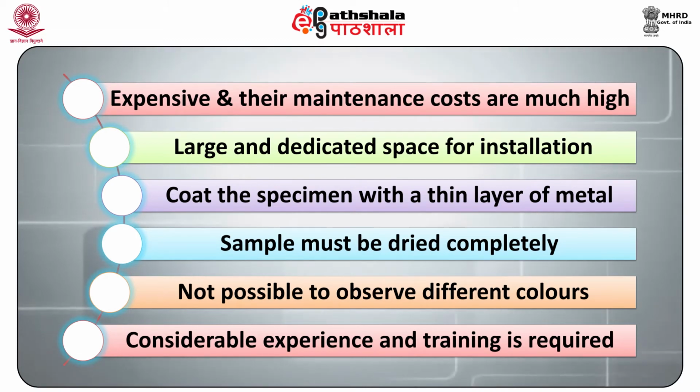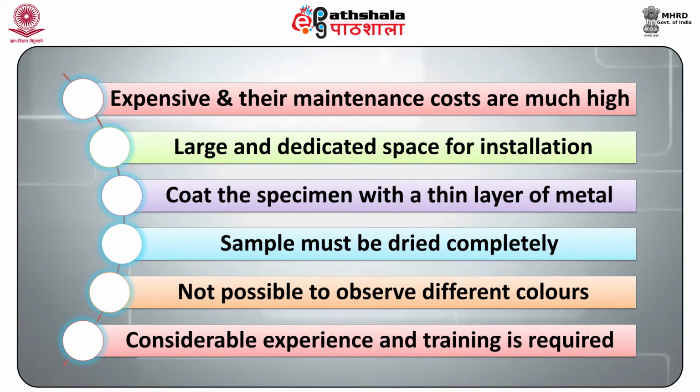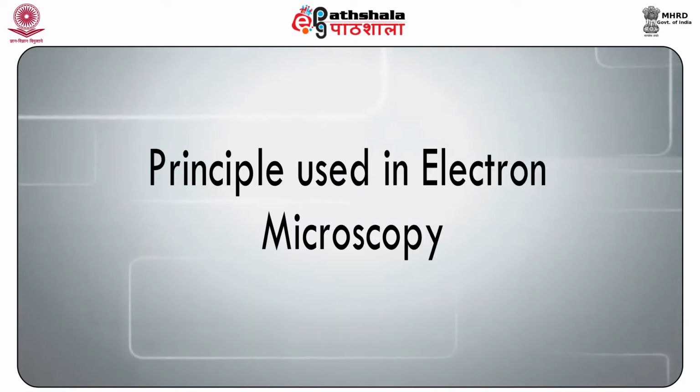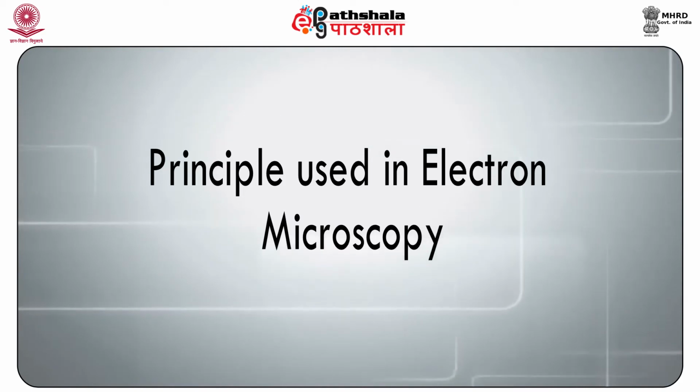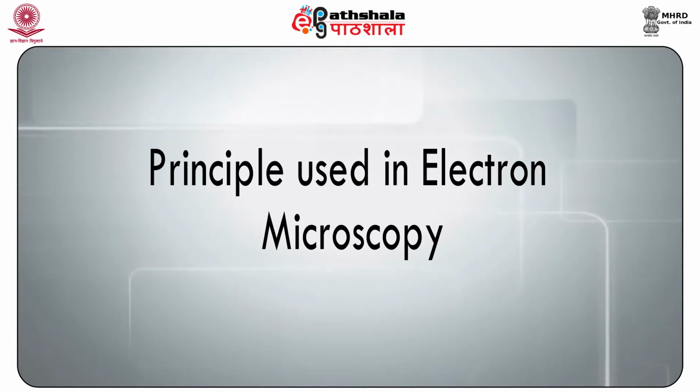Now, it is not possible to observe different colors in electron microscope. Considerable experience and training is required for experts to identify artifacts. Now, let me tell you something about the principle used in electron microscopy.